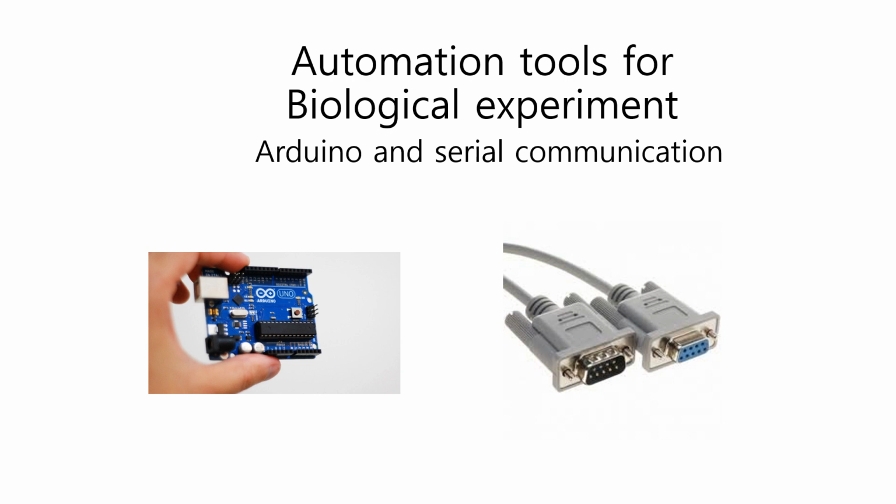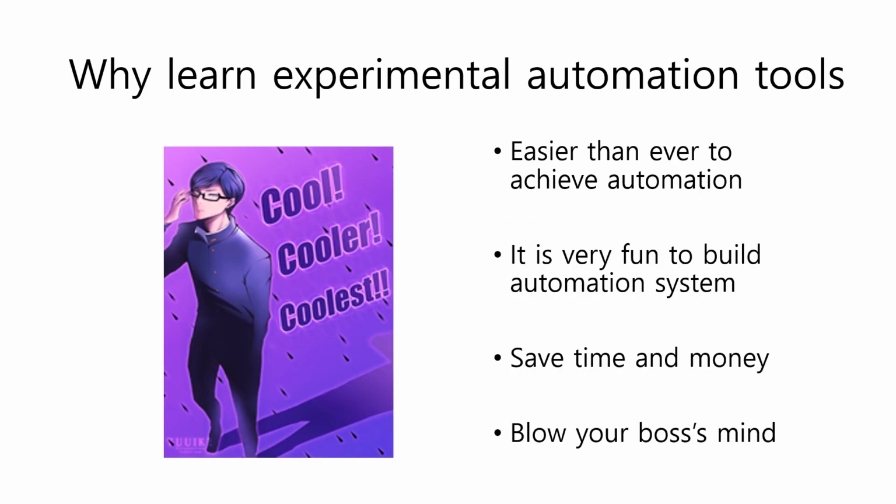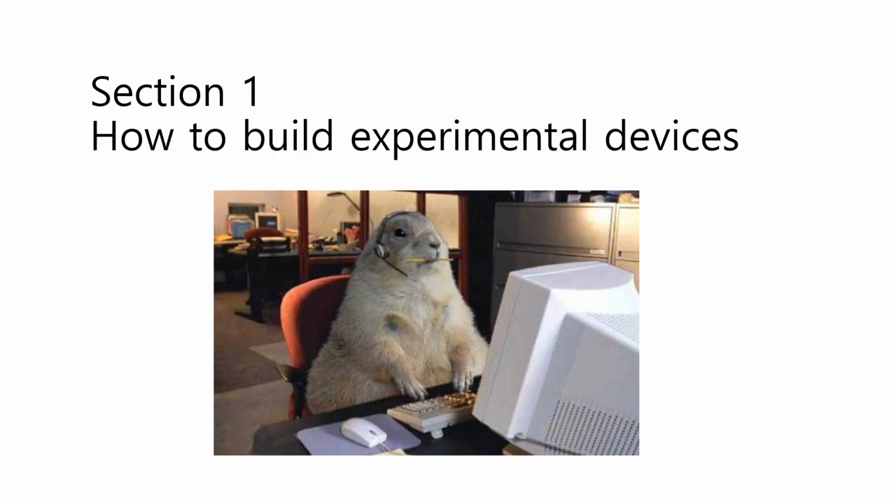Hello, I will introduce how to build experimental devices using hobby electronics tools and how to automate devices you already have to perform biological experiments. There are good reasons to learn automation skills. First, there are many great easy to use electronic tools and awesome online tutorials for automating tasks these days. Building automation tools is very fun. It saves a lot of time and money, and it really impresses your boss.